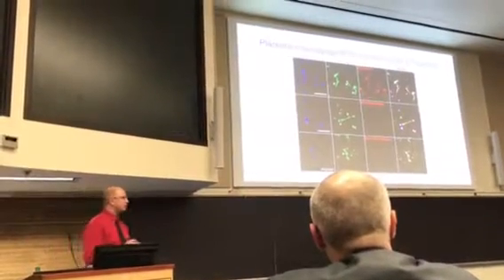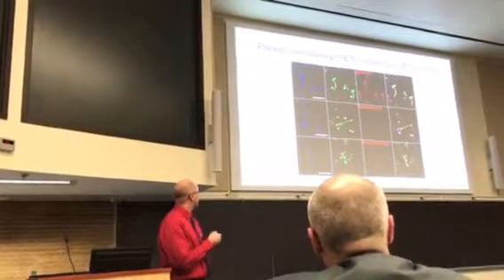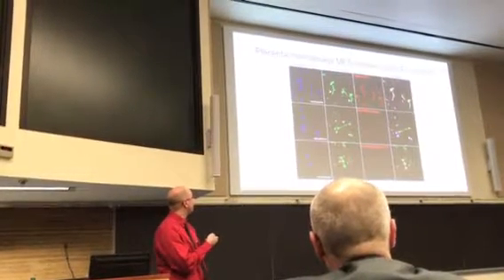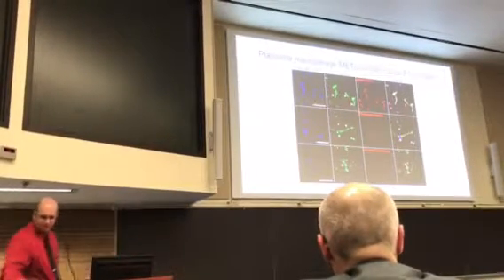Now, we wanted to look to see if these structures had hallmarks of other extracellular traps, including typical proteins, including histones, myeloperoxidase, and neutrophil elastase. And I'm going to turn down the lights to make it just a little bit easier to see.